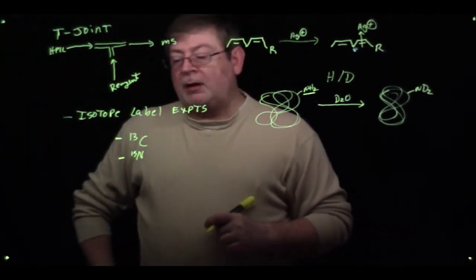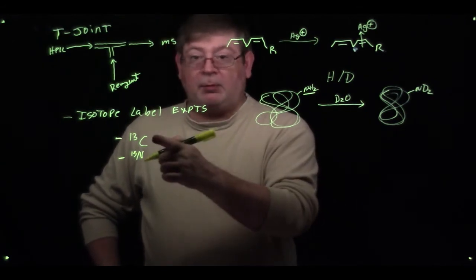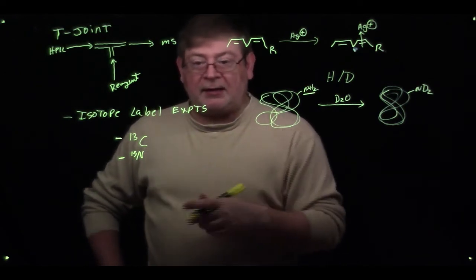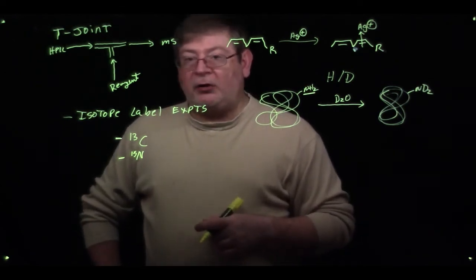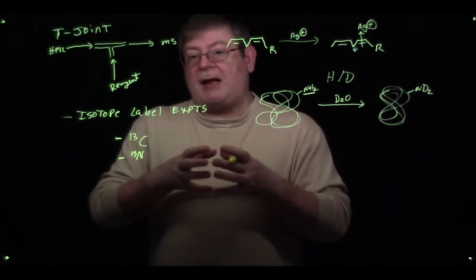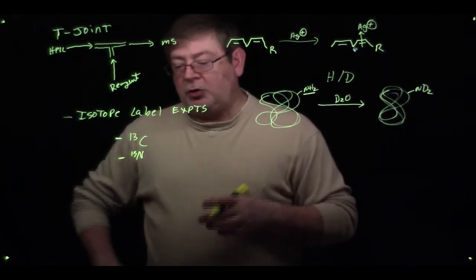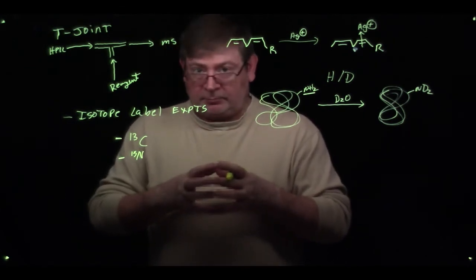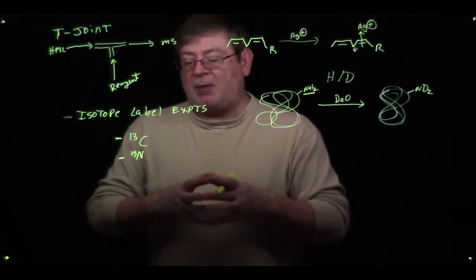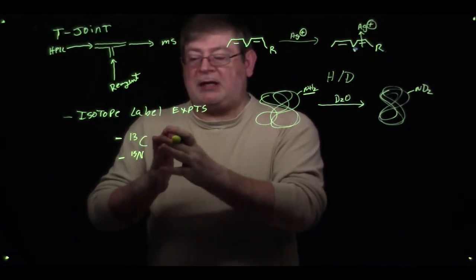They can do this quite easily. They will feed an organism, for example, carbon 13 labeled food, if you will, and nitrogen 15 labeled food. So you put this in the media that you're growing your bacteria in, and you get what we call a standard bacterium whose condition you know. Maybe it's a healthy bacterium, something that hasn't undergone genetic modification. And so you would look at the proteins from this that would be C13 and N15 labeled.